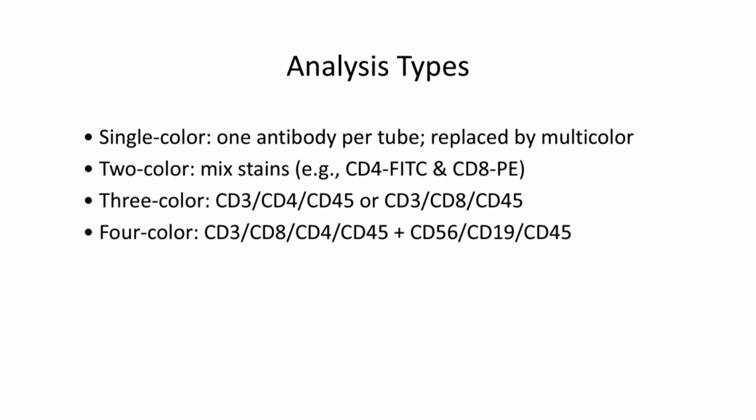in the same panel. Flow cytometers also provide quadrant statistics, calculating the percentage of cells in each region of a plot. Absolute counts can be derived by a dual platform method, using results from both the flow cytometer and a hematology analyzer, or by a single platform method using calibration beads within the cytometer.